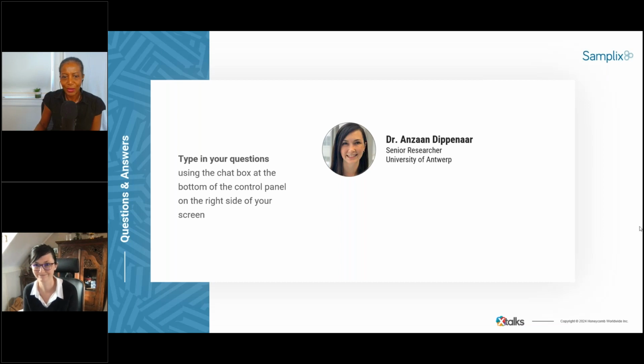Okay, all right. Sorry, I'm busy getting all these questions that are coming in fast and furious. So give me one second and I'll go to the next question. Okay, so the next question that we have for you is, transitioning to clinical samples presents challenges due to their high levels of contamination, raising concerns about the efficacy of SWGA in such settings. In the event of potential limitations with the SWGA, do you have ideas for alternative strategies?